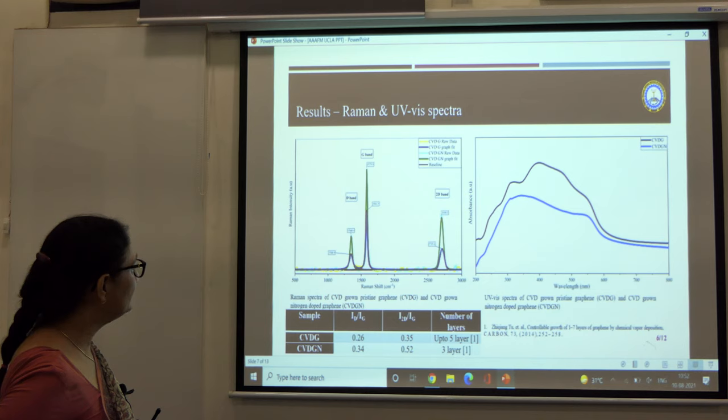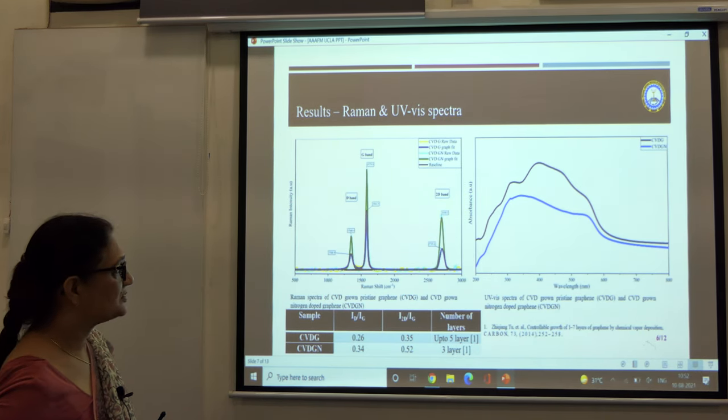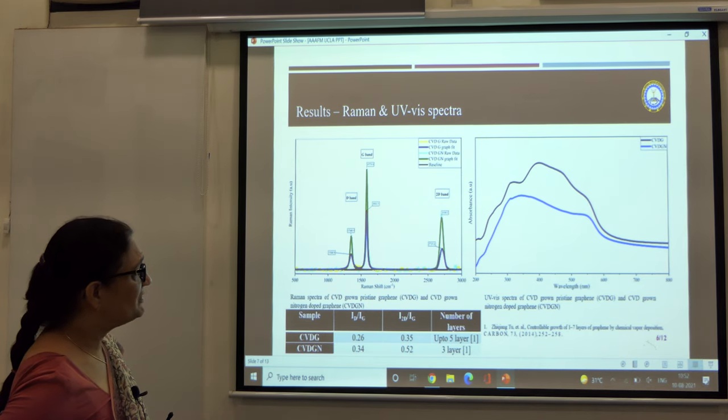For the nitrogen doped graphene it was three layers. And this is the UV visible spectra of these two graphene samples.